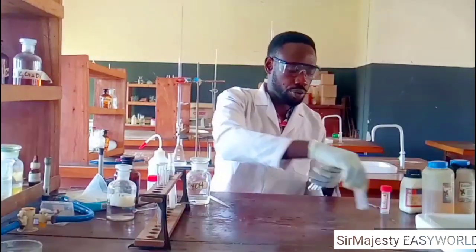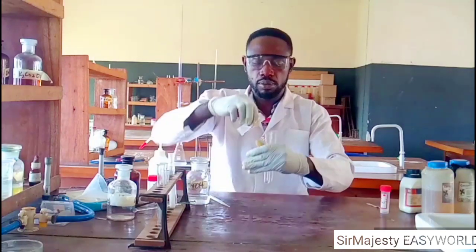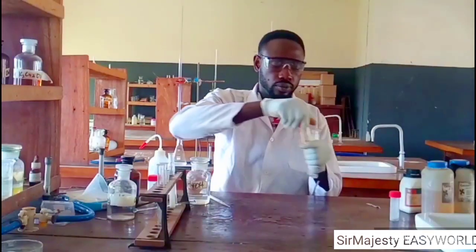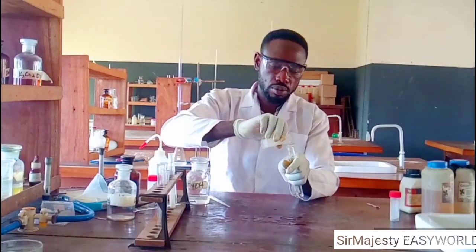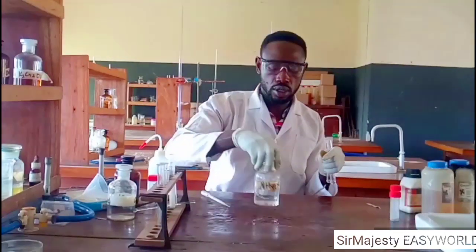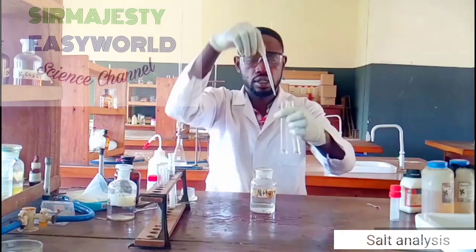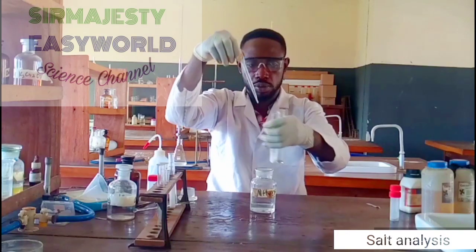I want to collect samples of lead nitrate and calcium chloride and apply the same thing I did with sodium hydroxide. This is my E, which is calcium chloride. I'm testing for calcium ion. So I'm repeating the same process we saw a few minutes ago, but now using aqueous ammonia, no longer sodium hydroxide. This is my lead with ammonia. There is still a white chalky precipitate.